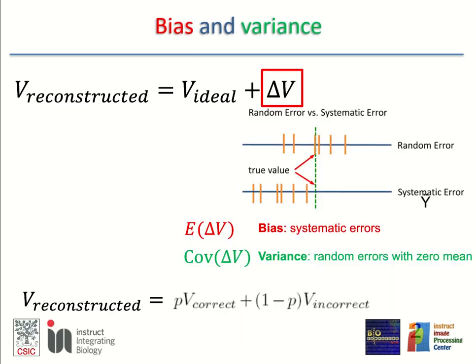So in all these processes we will have to estimate parameters, and when we estimate a parameter, there will be an underlying ideal parameter, which here is shown with the reconstructed map, but it applies to all parameters, and we will have some perturbation around that ideal parameter. That perturbation will be random, so we'll have some oscillations around the value, and this central value could be the ground truth. It can be something else. If it is something else, then we say our parameter estimation is biased.